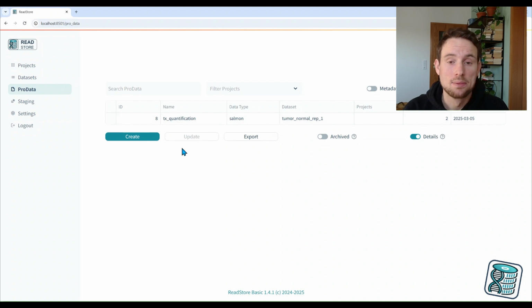So that was it for building Nextflow workflows in combination with the ReadStore database.